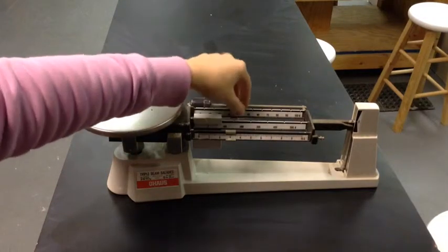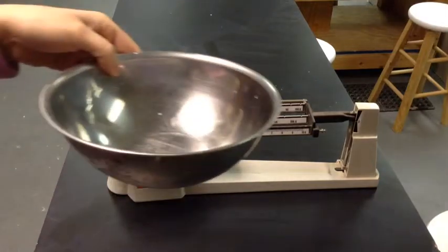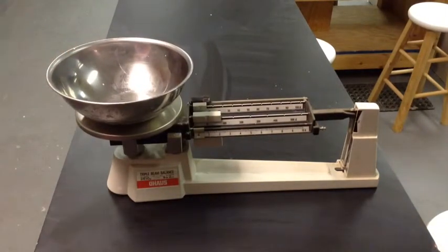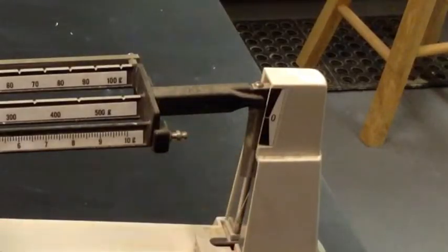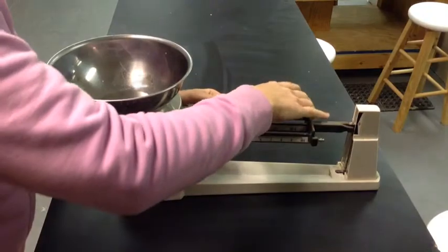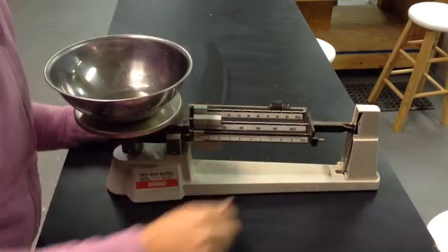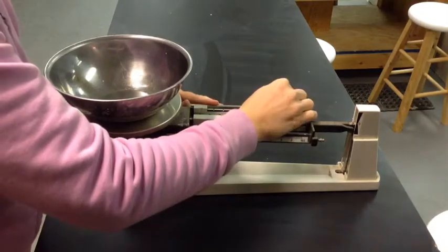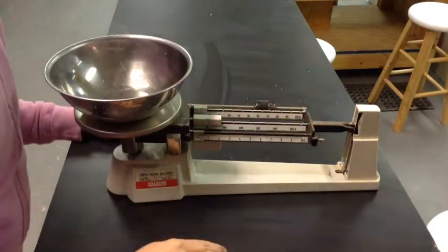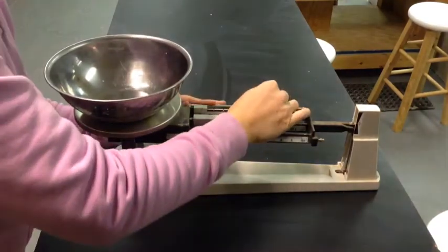When making ceramic glazes, often you need to use a container in order to measure your dry ingredients. Place the container on the pan, and you notice that now we need to zero out the scale again because we only want to measure the weight of the ingredients, not the weight of the container. So adjust the weight on the beam and continue making small adjustments until the beam starts to move.